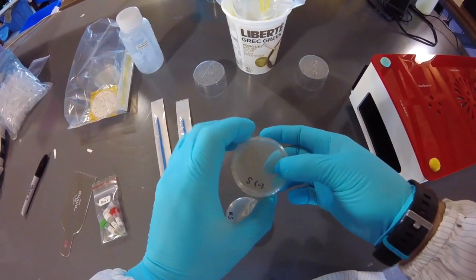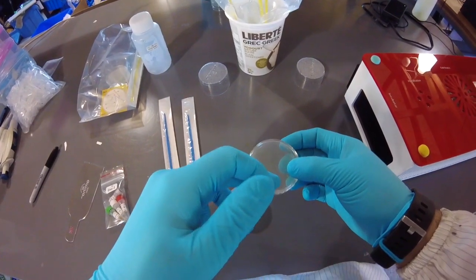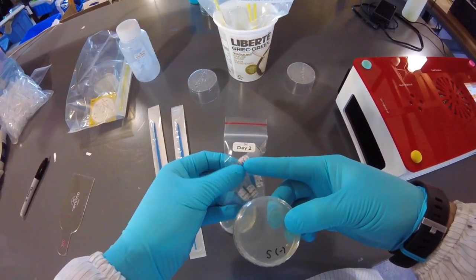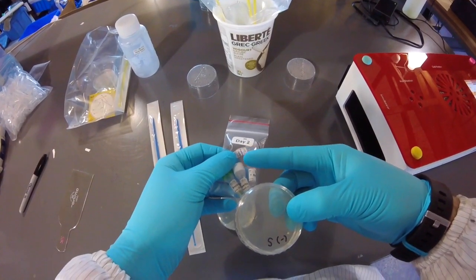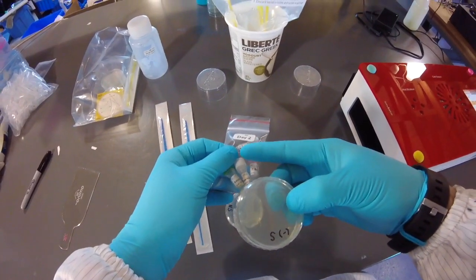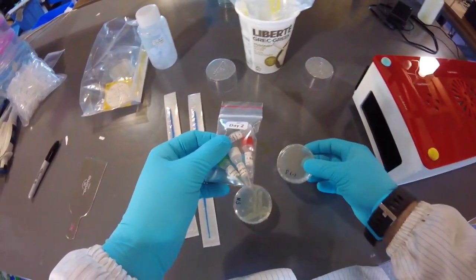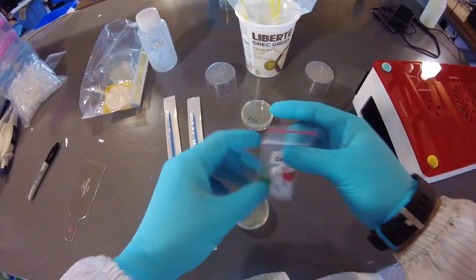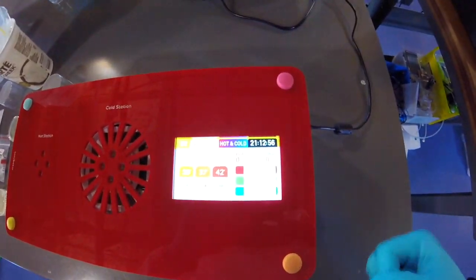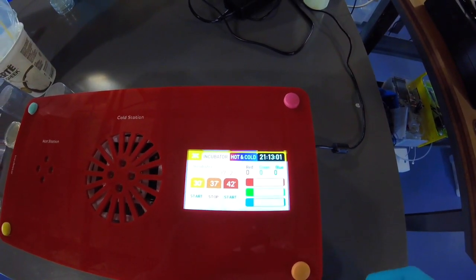Okay. In tomorrow's exercise, we're going to have a positive control plate where we use the positive control cells within the day 2 bag to streak, and in that case we would be expecting a result. We would be expecting these cells to grow because they already are engineered, okay? And so that would be kind of the opposite kind of control, okay? So yeah, I guess let's get to it here. So just to let you know, we're sitting at about 21 hours after the activity yesterday, okay?